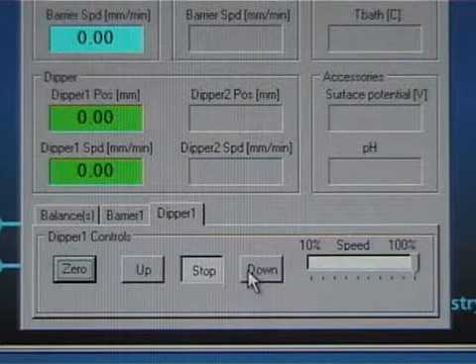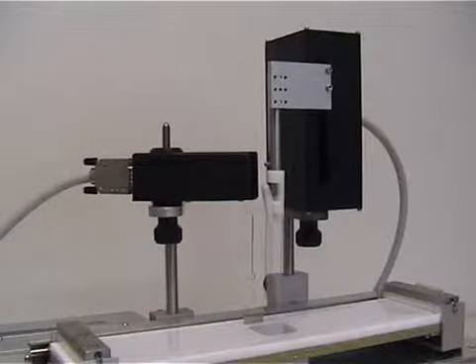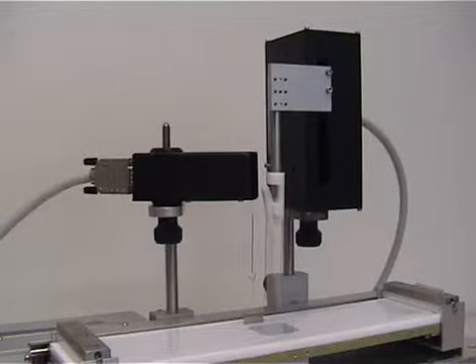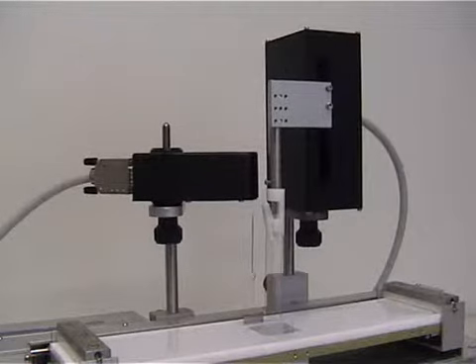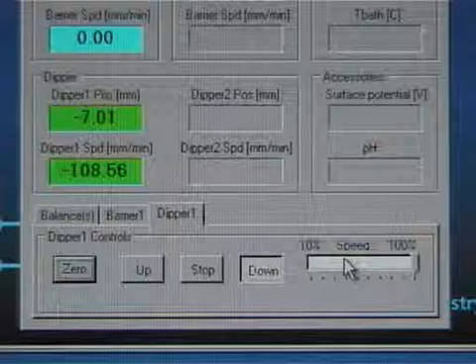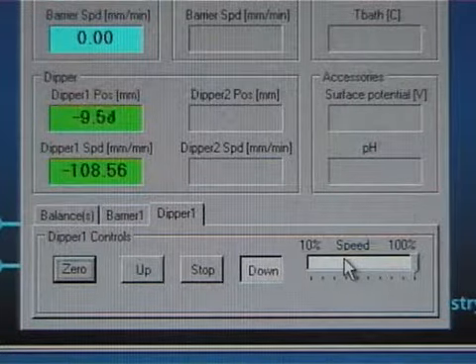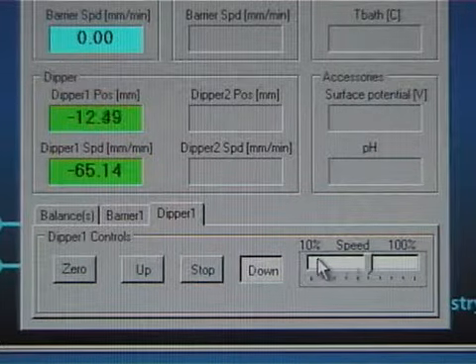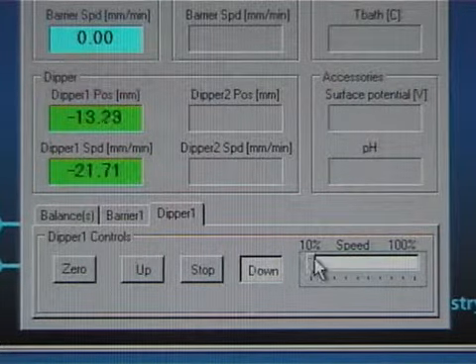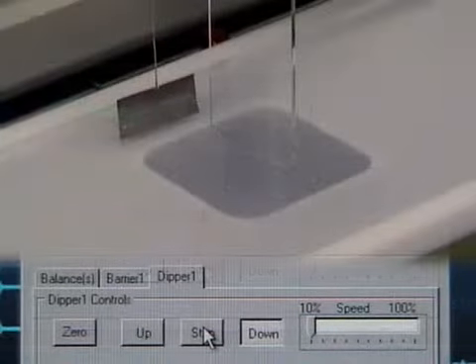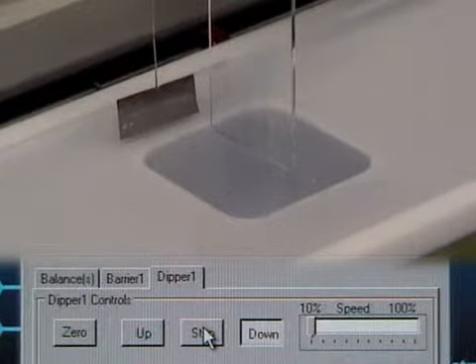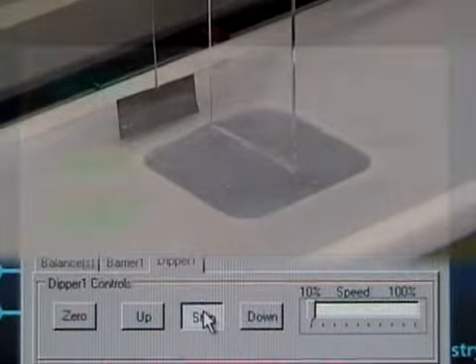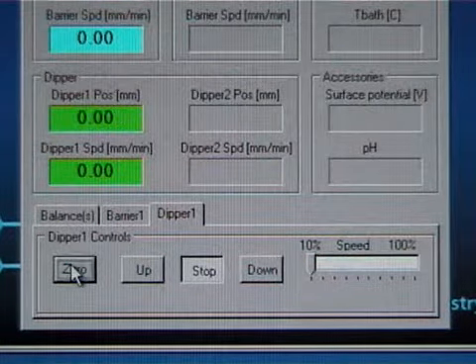Lower your sample until it touches the subphase surface. Then zero the dipping position.